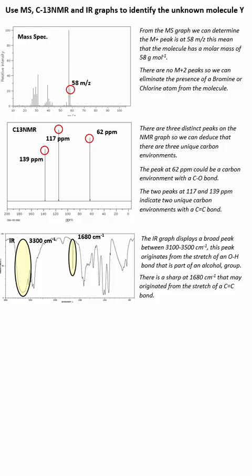Now we have all of these other peaks to the right of 1500, but to the right of this graph is called the fingerprint region. That is, we can't use those peaks very well to identify exactly what the bend or stretch was, where it came from. But if we got this picture and we already had a picture of the unknown molecule, we could match them together and find out that it was the unknown molecule. So these peaks here are distinct for this molecule, but we can't use them if we don't know what the molecule is. Anything under 1500, we just ignore.